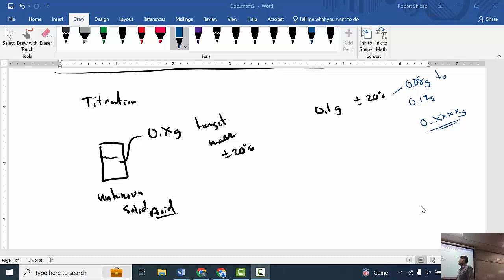To conserve sodium hydroxide, so we don't run out, go to the low side. Be closer to the 20% below. And this is not a strict window. If you're less than or more than 20% off, don't worry about it. Just get something in that range. Try not to go over too big, because then you're going to have to refill the burette, and you have the potential of running out of sodium hydroxide.